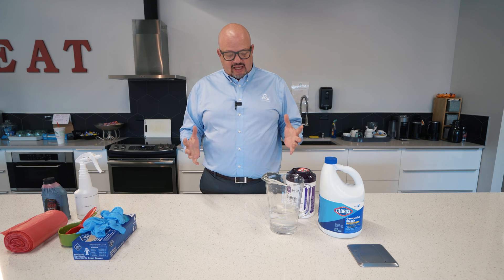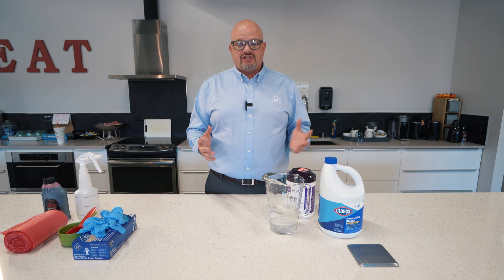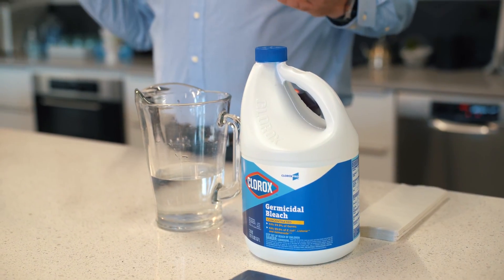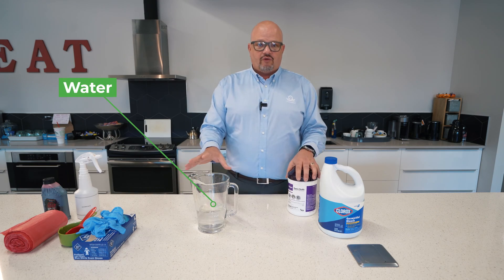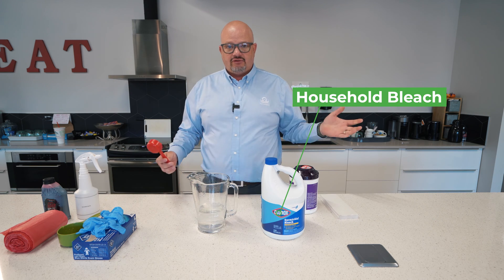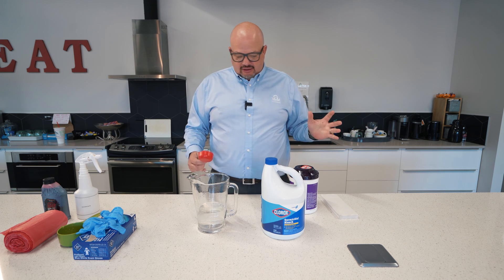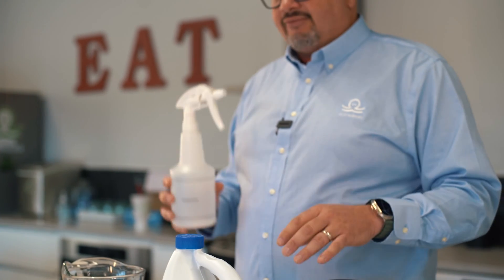First, let's look at what we're going to use to disinfect the surface, whether it be a floor or a countertop like we're dealing with here today. I have two and one-fourth cups of water and just regular household bleach — 5.25% bleach.